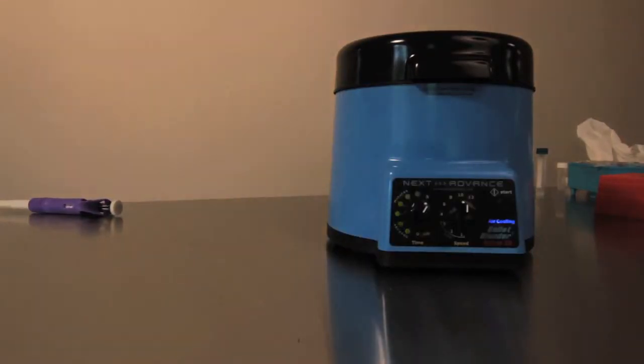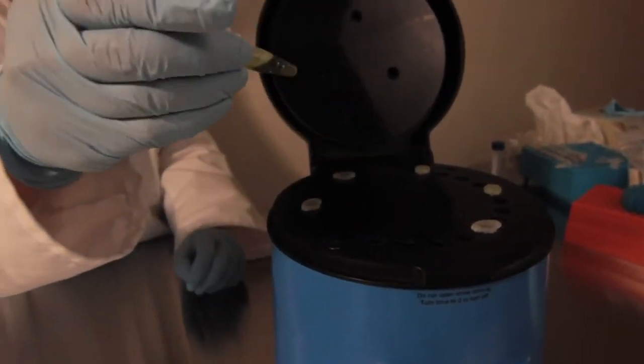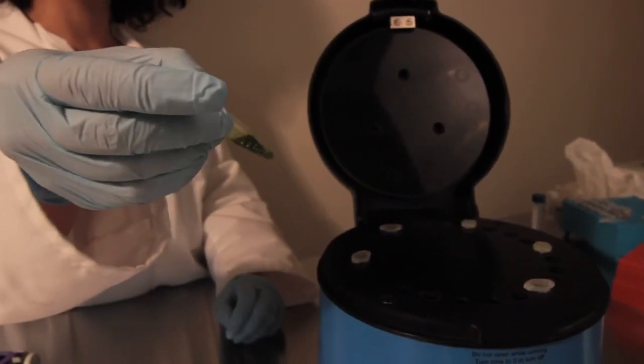Examine your samples. If you see unhomogenized pieces, place them back in the bullet blender and homogenize for another minute or two at speed 10.